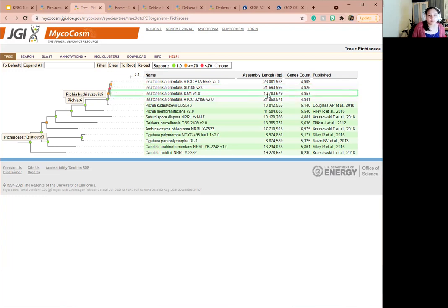So the two species we were looking at were the Dekkera and Pichia. So here we see Pichia. And we want to check or verify that Dekkera, which grows on galactose and Pichia, which doesn't are sibling taxa. So if we go up the tree, we see Dekkera right here. And we ended up finding out this green box highlights all the ones encompassed, we see that Dekkera and Pichia are in fact sibling taxa.